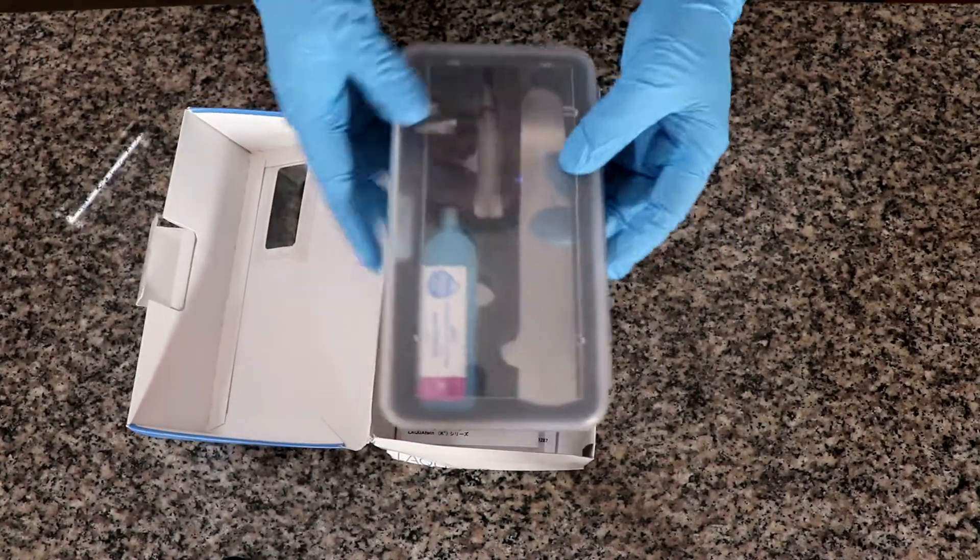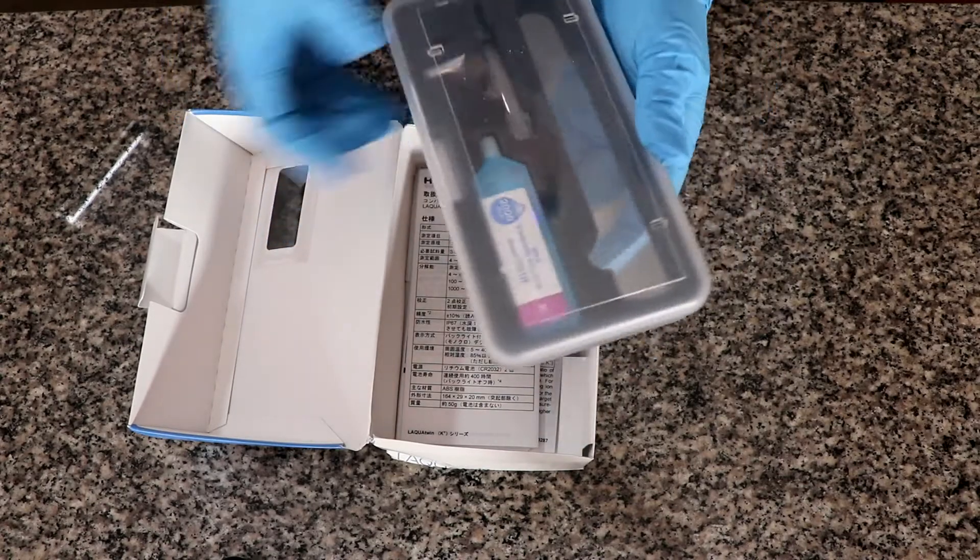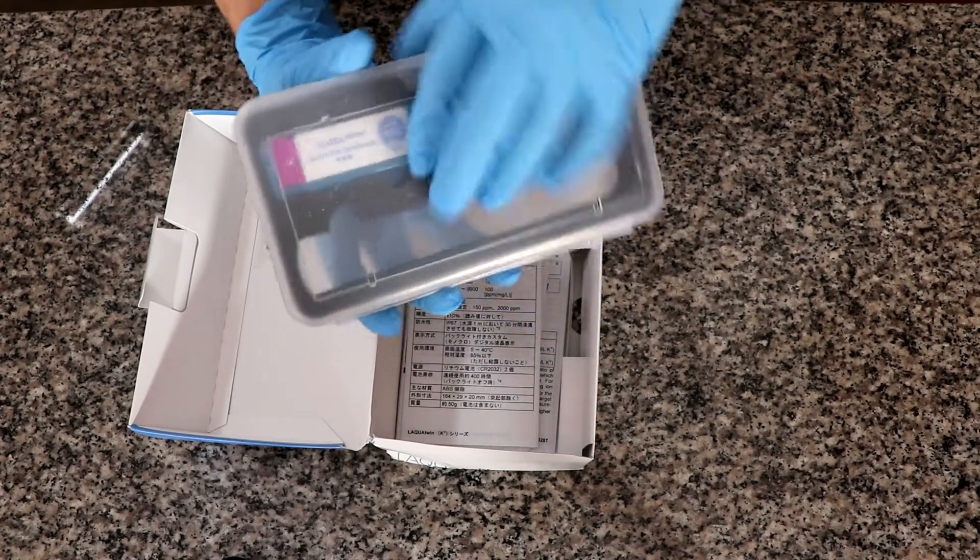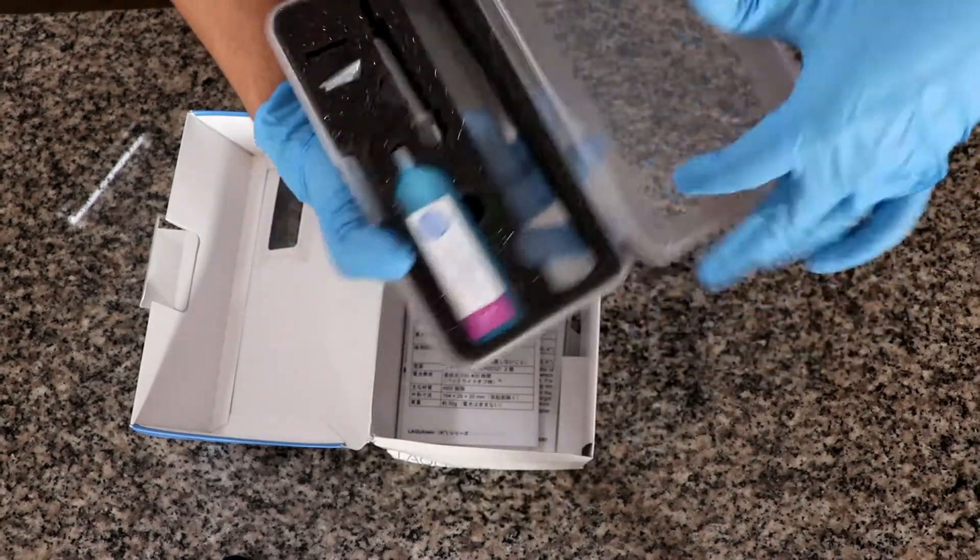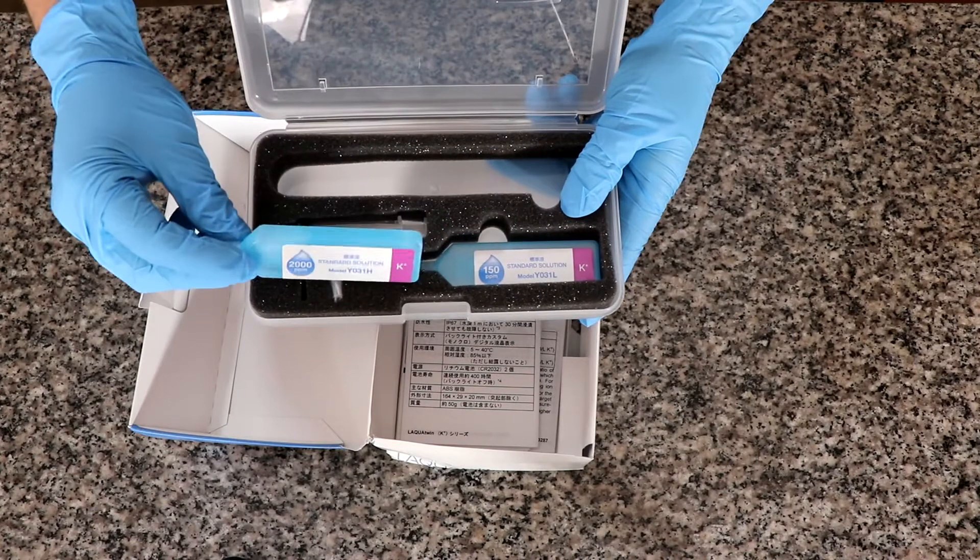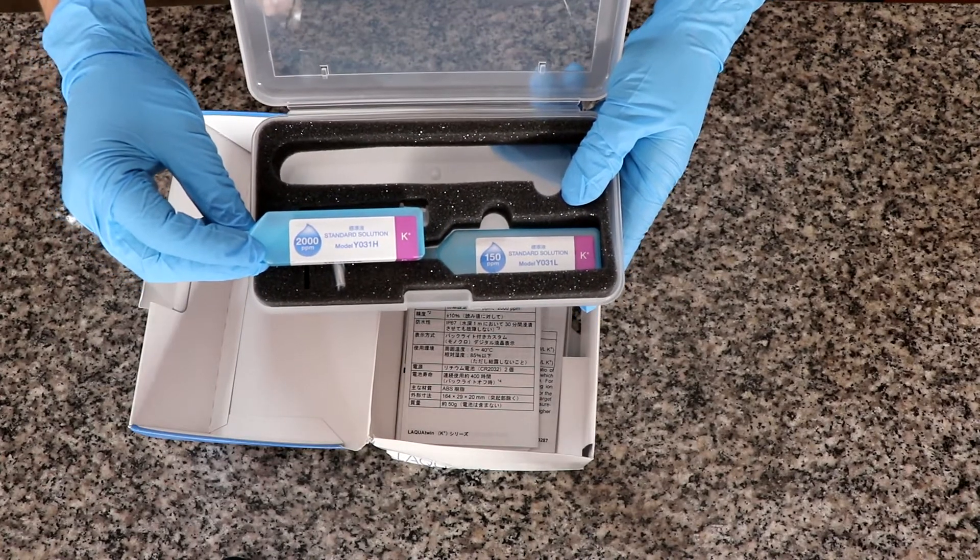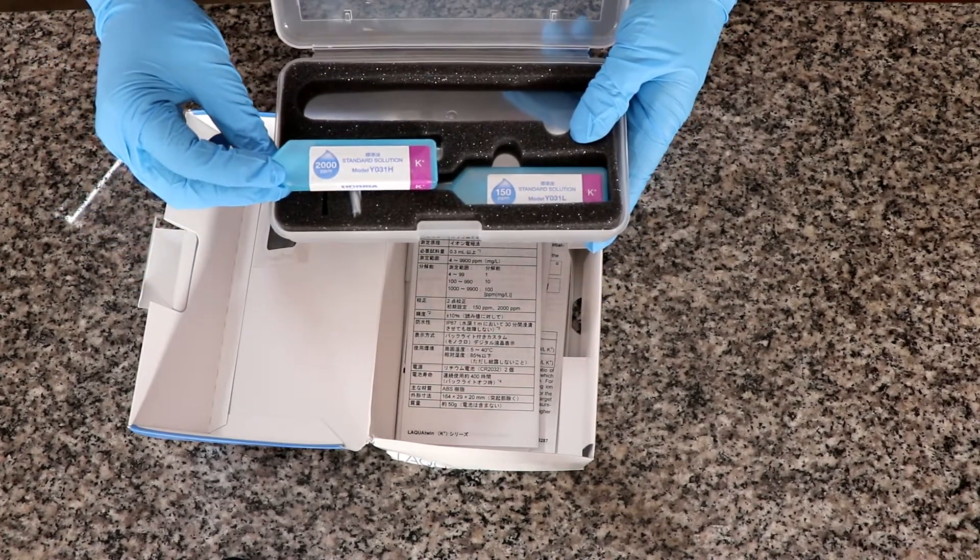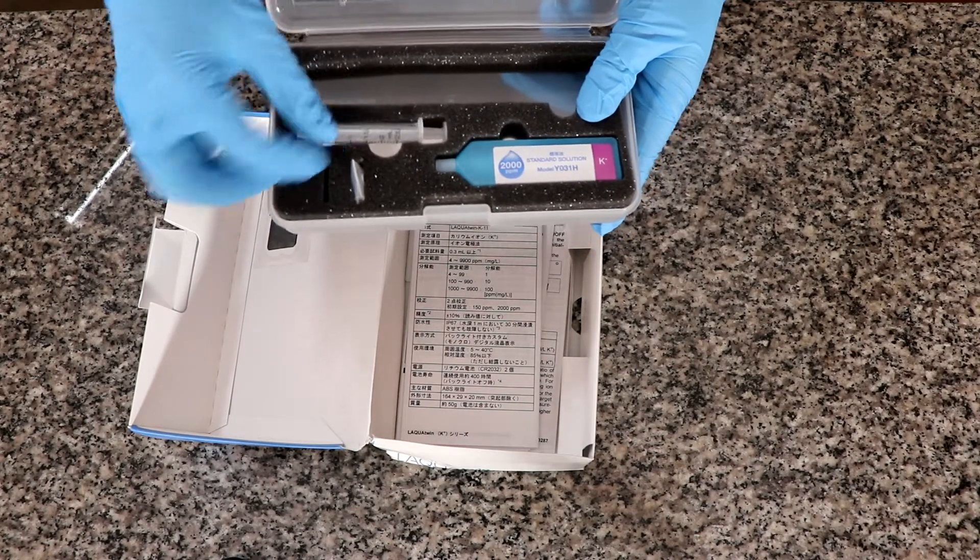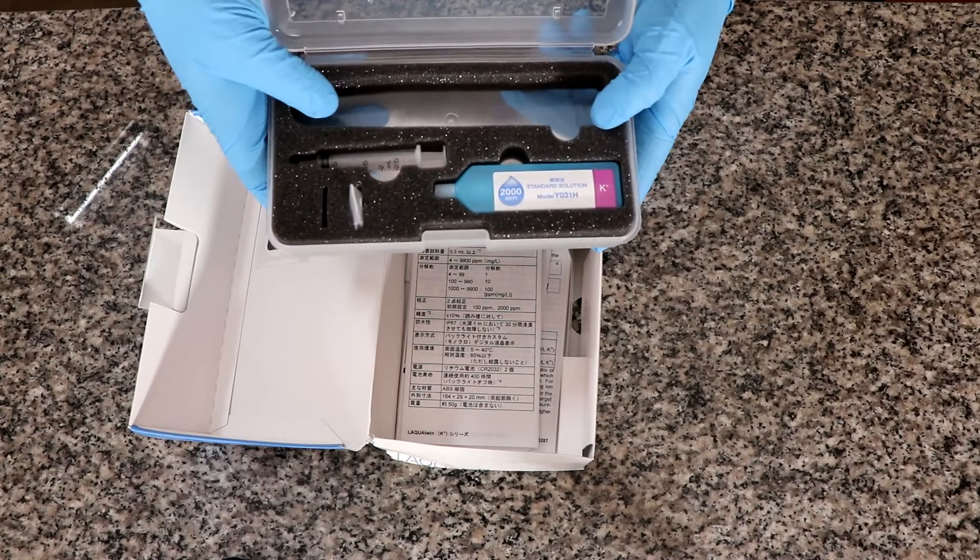We also get this case, which is where we will store the electrode after we assemble it. Inside this case, you can see here, we have the calibrating solutions. We have two to perform a double point calibration and then we have the syringe that we can use for samples and the space for our electrode.